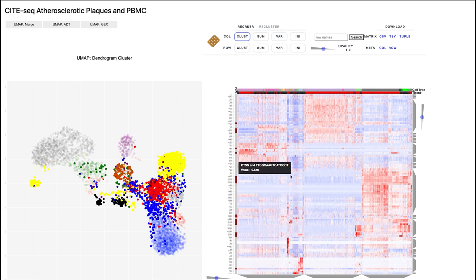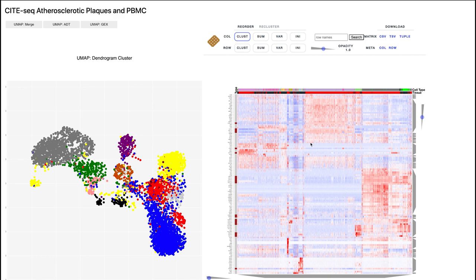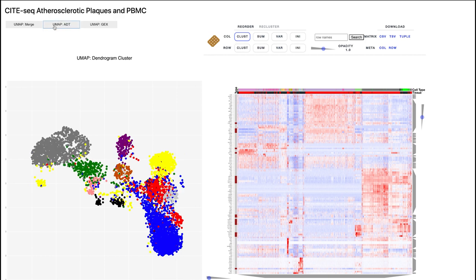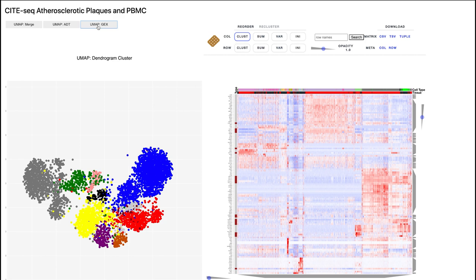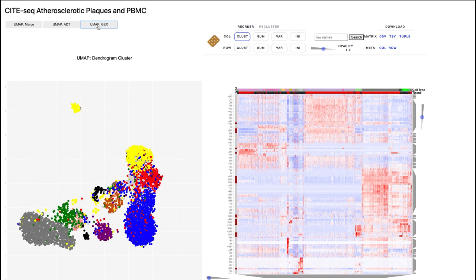For instance, if a cluster isn't rich for a particular cell type, that tells you something. One last thing to touch on: in this case we happen to have two different datasets co-mingled, but we can run the UMAP on the merged dataset. We can also run the UMAP on different subsets — if we run it just based on protein levels, or what's referred to as ADTs, we get this representation. We can also run the UMAP based on gene expression alone and see another representation. The interactivity adds a lot of flexibility in terms of understanding and exploring these datasets.